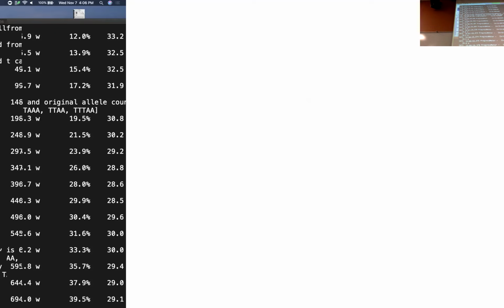Okay, I'll quickly talk about the GATK. And what I'm going to be saying about the GATK applies to some other tools like FreeBayes. And the reason why they are superior to some other SNP calling pipelines. One, they give you the option to do any level of ploidy, right? Some tools, you can only do a diploid, right? They offer as much as a tetraploid, a hexaploid, an octaploid if you're working with something like strawberry.